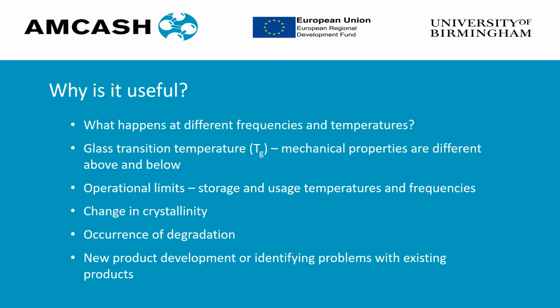DMTA can be a useful technique to assist in new product development or in identifying problems with existing materials, whether that's comparing different materials or the effect of different additives or processing conditions.